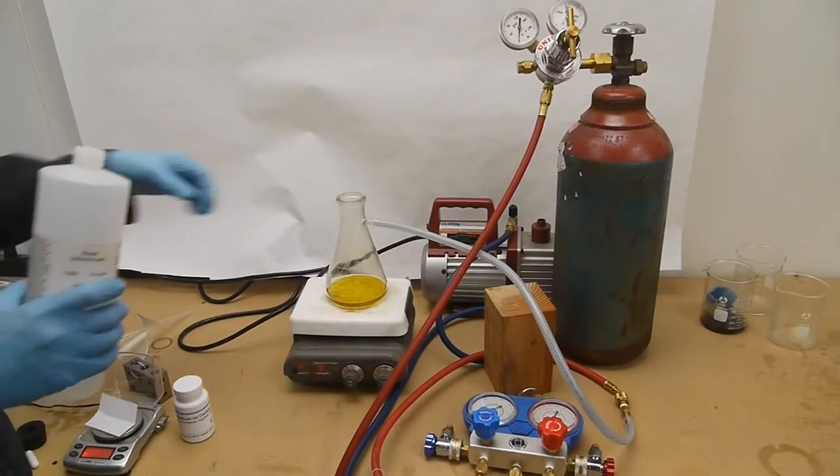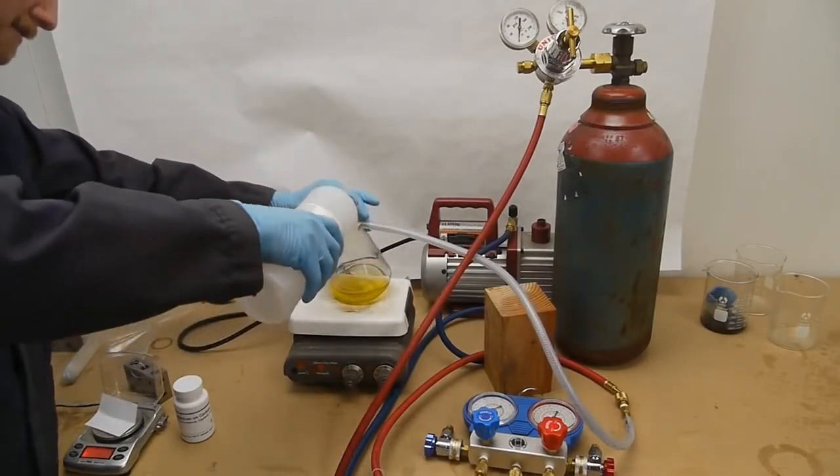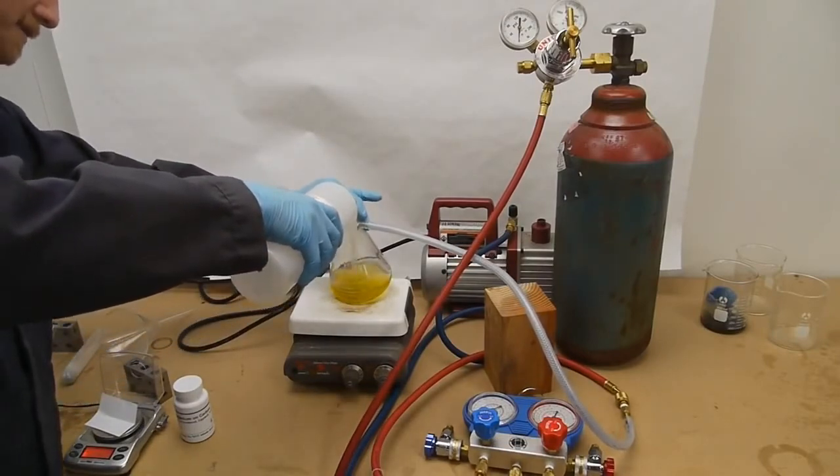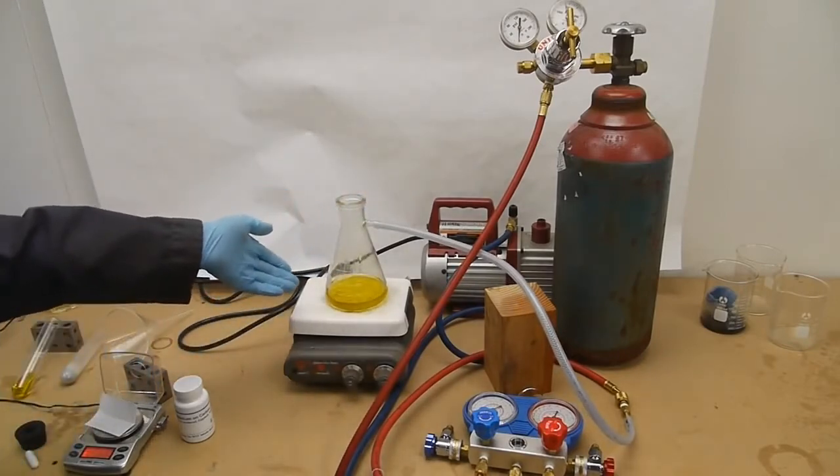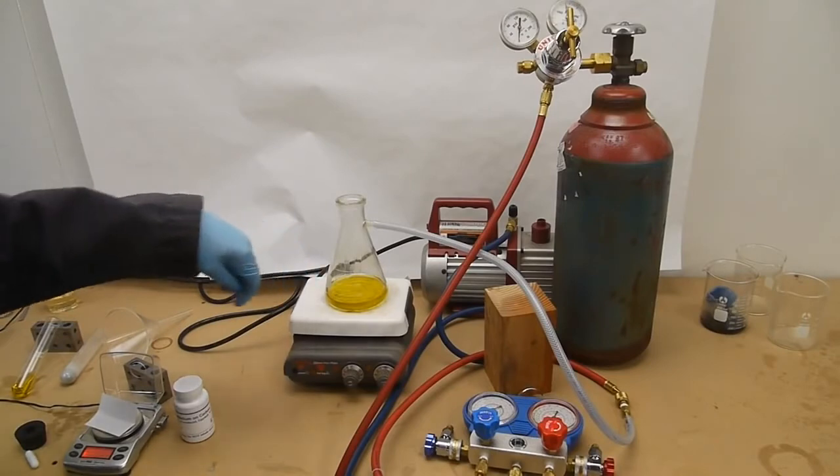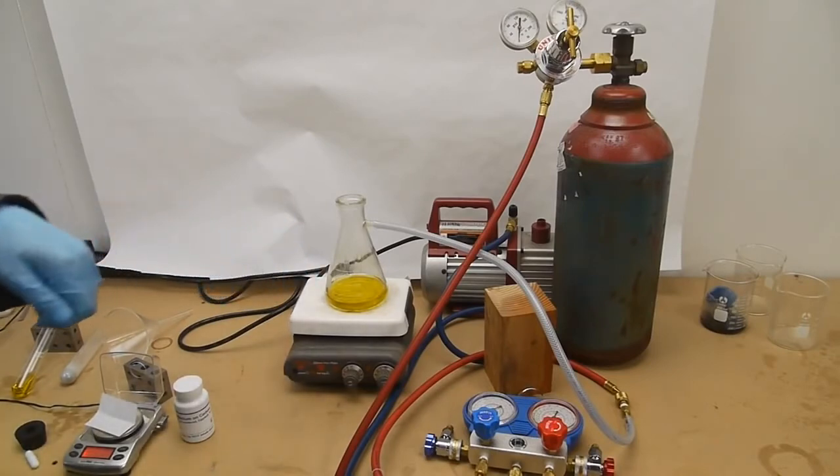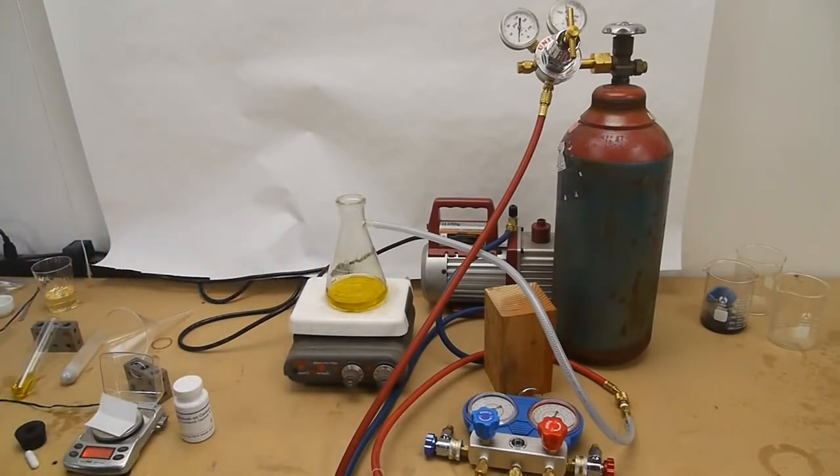To the olive oil I'm adding hexane, which is going to serve as a solvent. Since we're creating a hydrogenated oil or solid oil in here, we need a solvent to prevent this from forming solid chunks and making the reaction slow down. The hexane just serves as a carrier to keep everything liquid.